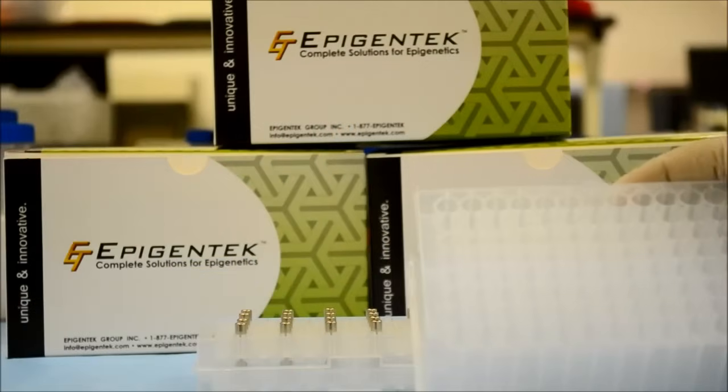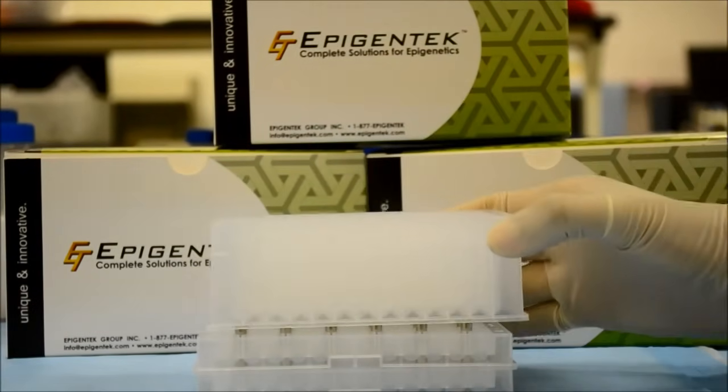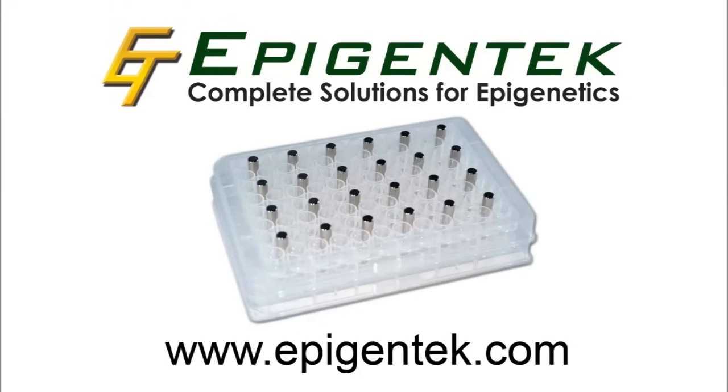Compatible with all standard microplates, the EpiMag also fits with 1-2ml deep well microplates. Simple and powerful at an attractive price, the EpiMag belongs in your labs today.